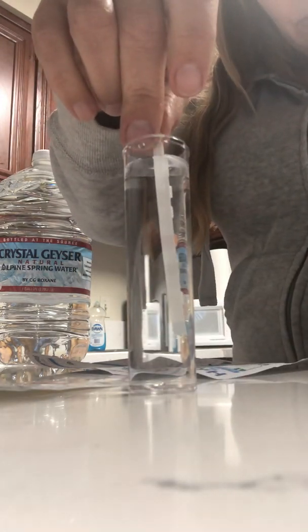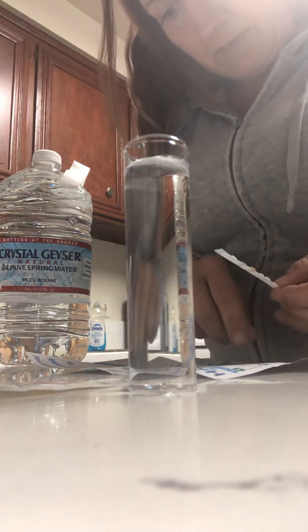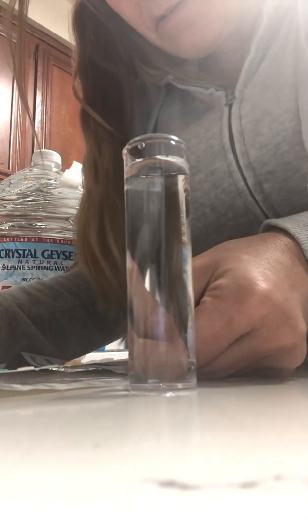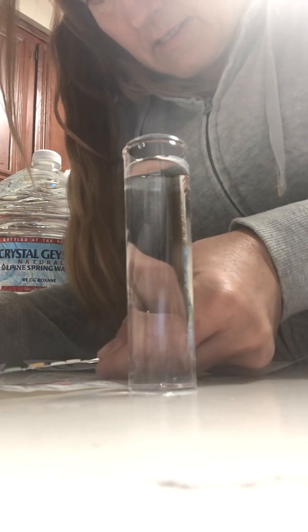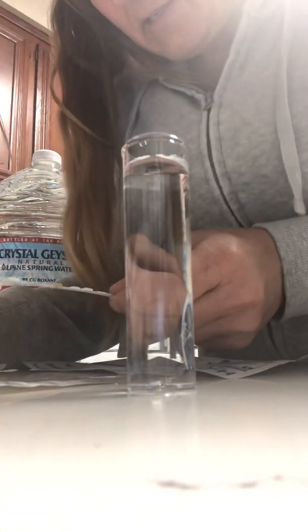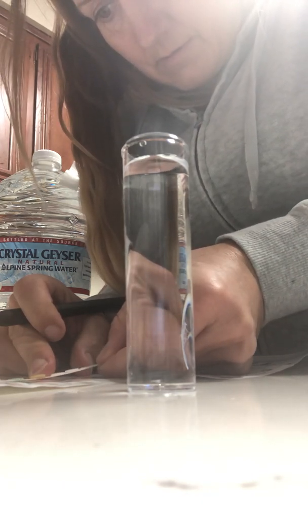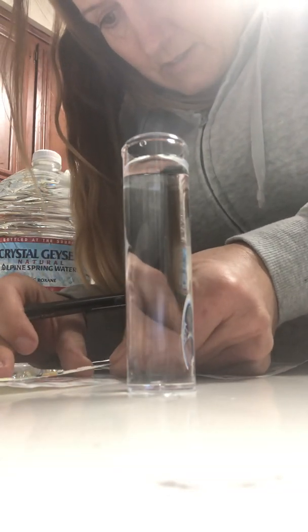One one thousand, two one thousand. Shake excess water. Pads up. Immediately read for hardness — it's going to be 100. And the chlorine is going to be 1. And the alkalinity — it's going to be 80. And the pH is going to be 7. And the nitrite is going to be 0. And the nitrate is going to be 5.